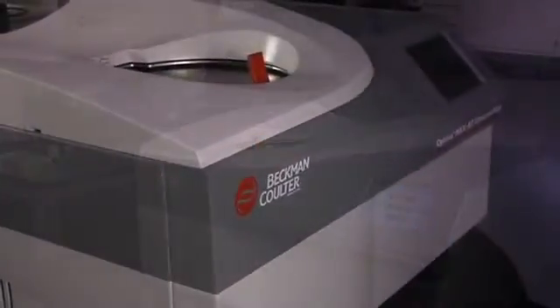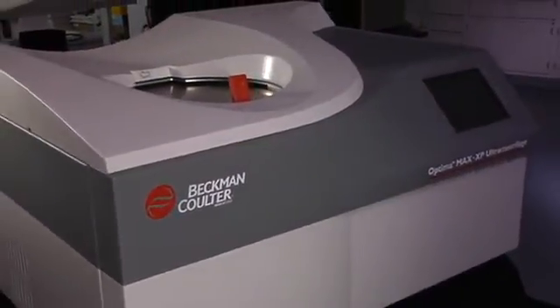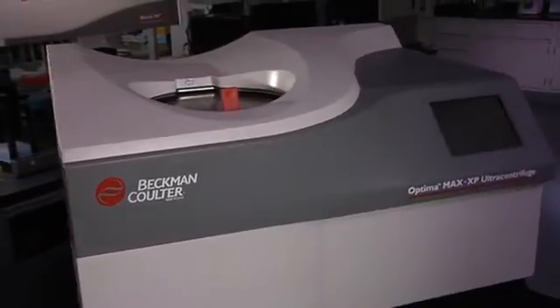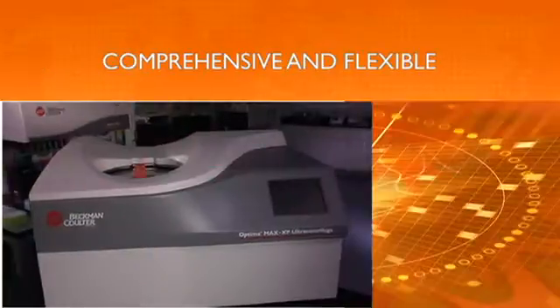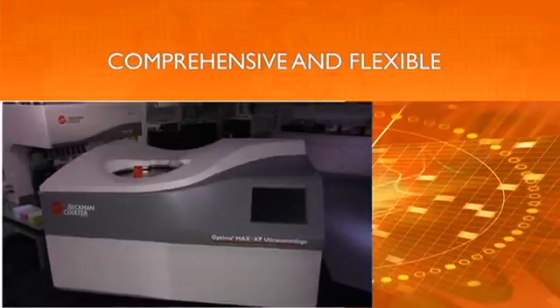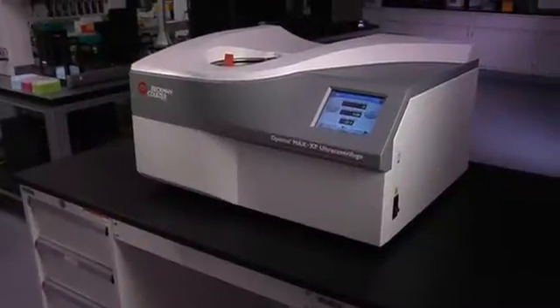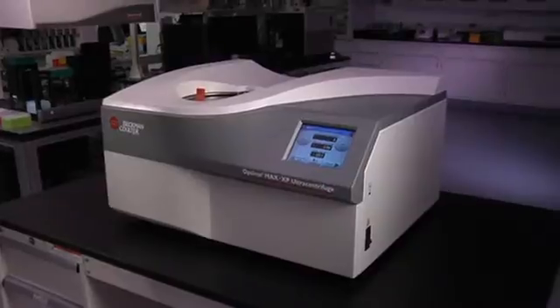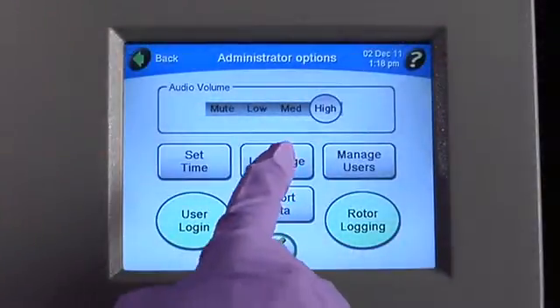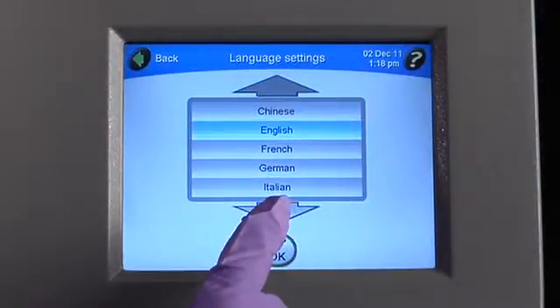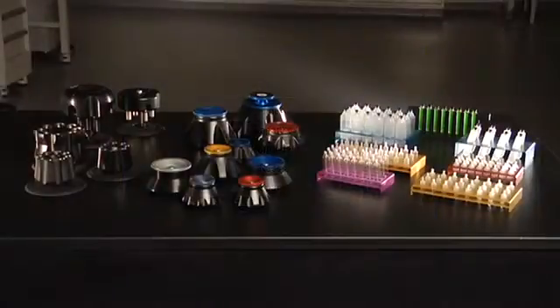Beckman Coulter is the worldwide ultracentrifugation leader and the Optima Maxx TL tabletop ultracentrifuges deliver the most comprehensive and flexible platform available today. The Optima Maxx series delivers market-leading user interface software in an array of native languages and an unmatched choice of rotors and labware.